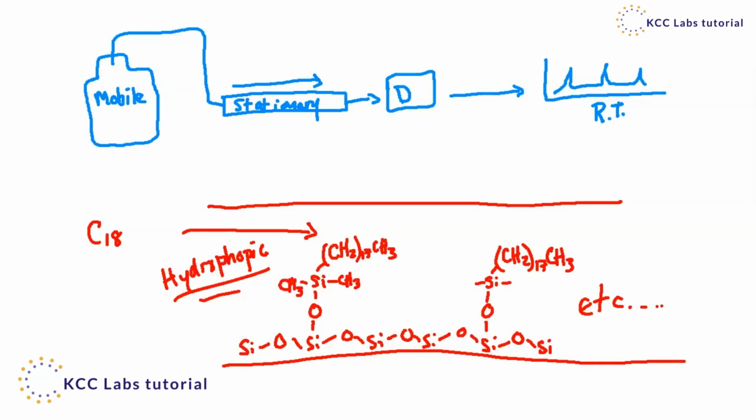Now, this is very important. The choice of column and solvent phases will always play a role in your separations, and you want to maximize the efficiency of those separations, which again could be its own lecture in terms of how we maximize retention time and how we get good resolution so the peaks aren't too clustered together. We'll address that as we go along in this course.